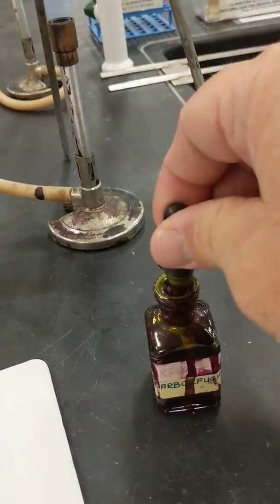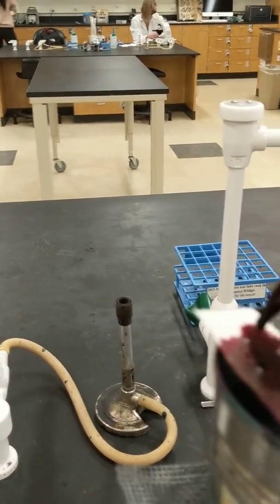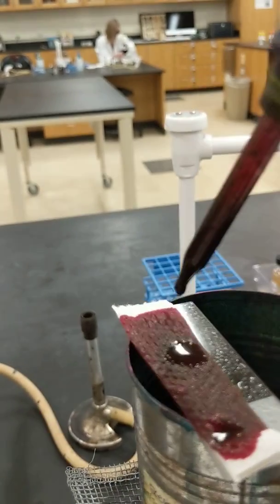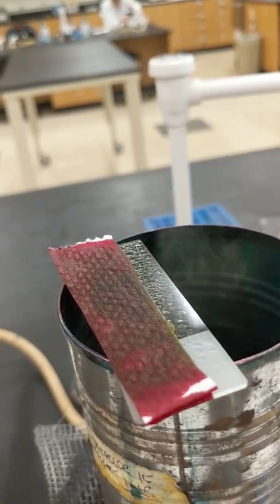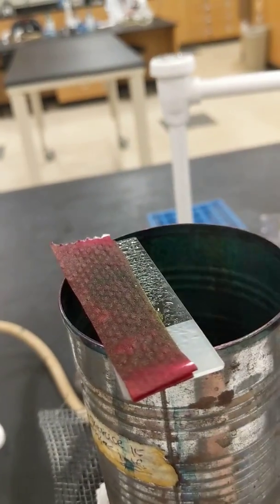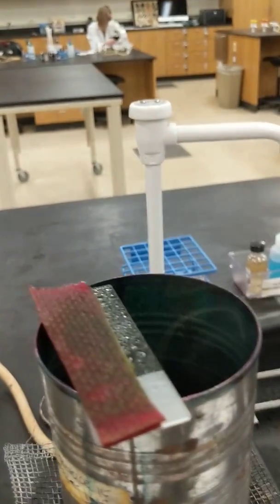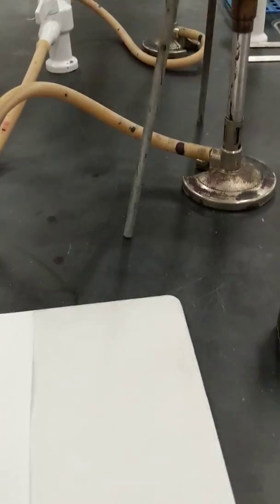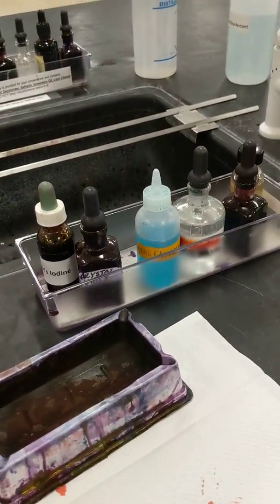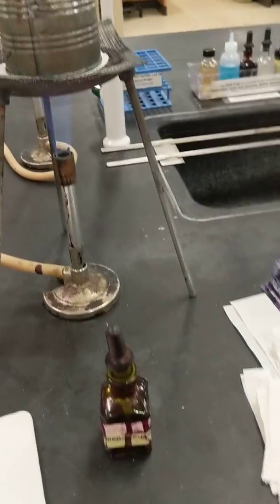And then what you're going to do is put it on top, and you just want to keep it moist. The steam will help keep it moist, but if it starts to dry out, then you add a few more drops of your carbofuchsin, so you make sure that it is exposed to heat and steam the whole time. After this, you're going to destain it, and you're going to use some acid alcohol, which is from your materials in here, and then you're going to use the methylene blue.